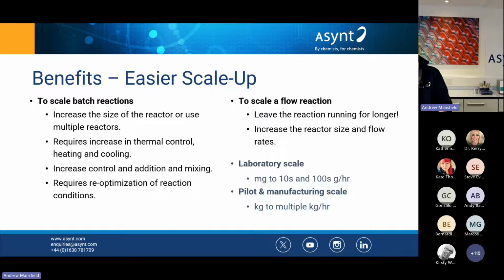And if we're working on a 50 milliliter reaction, adding our reagents doesn't take that much time. But if you're looking at 10 litres or 50 litres, the addition rate, controlling the addition of our reagents, takes a lot longer. And all of those things need to be taken into account.